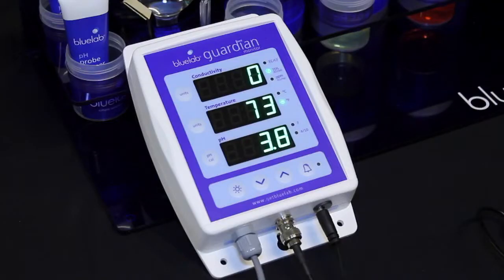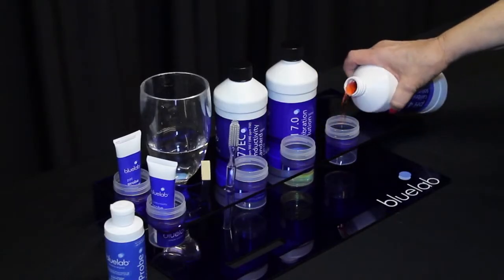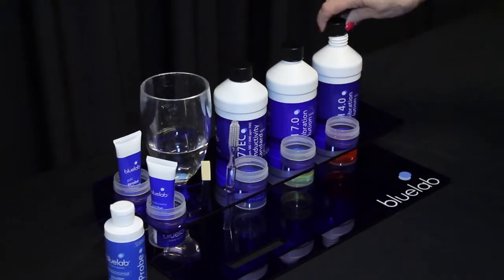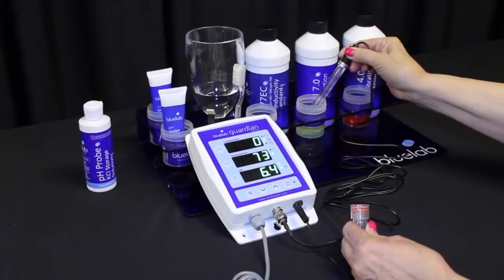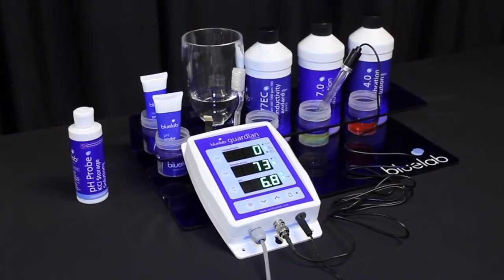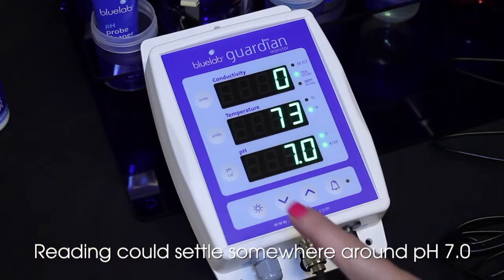The pH probe needs to be calibrated to the monitor before you take readings. Calibrate your pH probe to two points for accuracy. Use freshly poured pH 7.0 and pH 4.0 calibration solutions. With the Guardian plugged into a power source, place the probe in pH 7.0 solution. Be sure to wait until the reading has stopped moving.